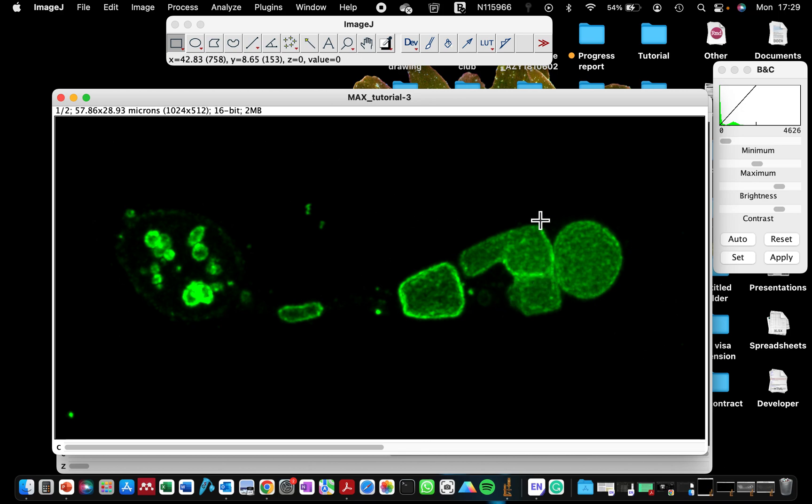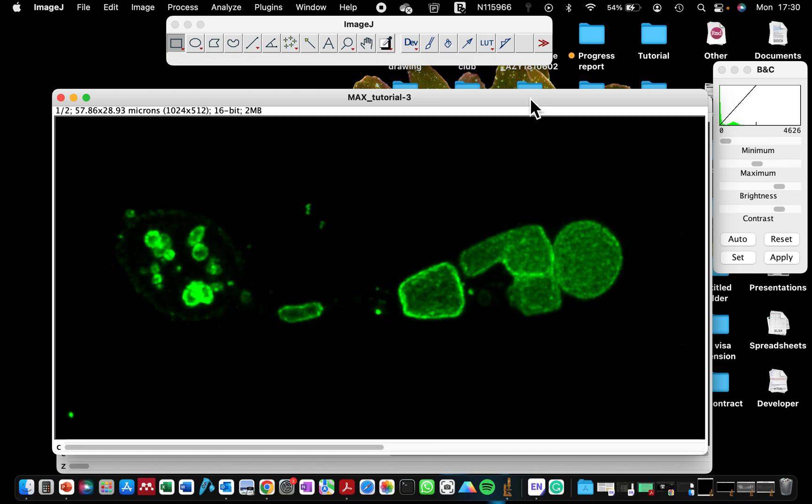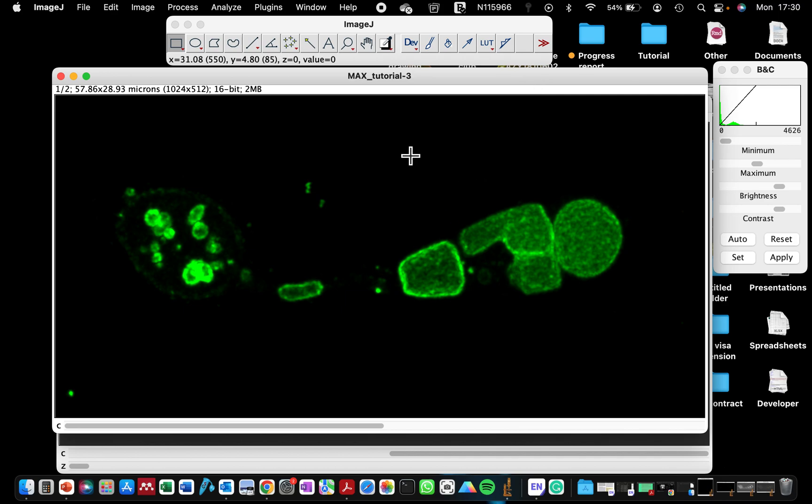You can see that the 0.3% increments of pixels has been applied across all images, not just the fluorescence image. Even the dark area of the images have been modified with the 0.3%.